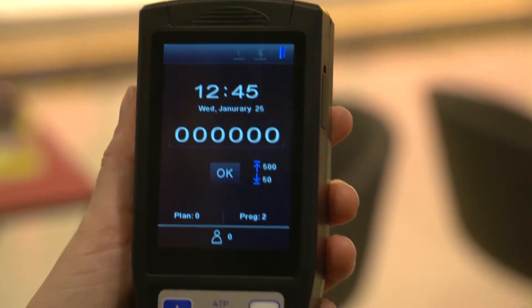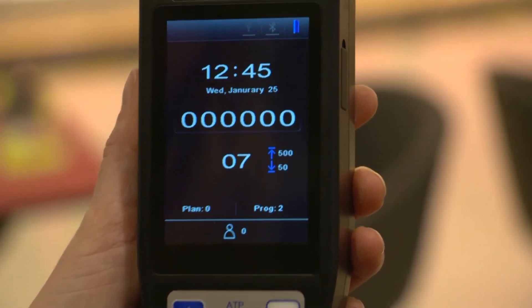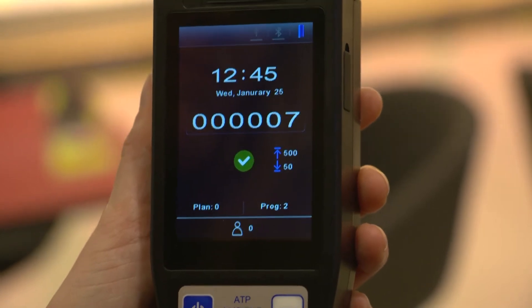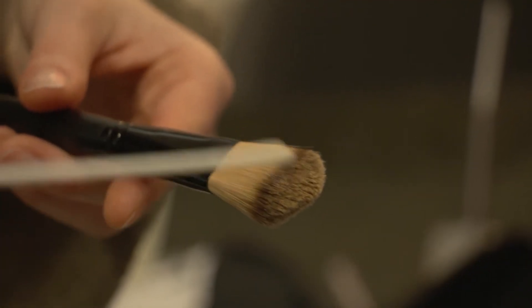Insert the whole test tube into the measuring chamber of the PCE ATP-1 food hygiene testing device. After 20 seconds, the measurement results are shown in relative light units on the device's display.